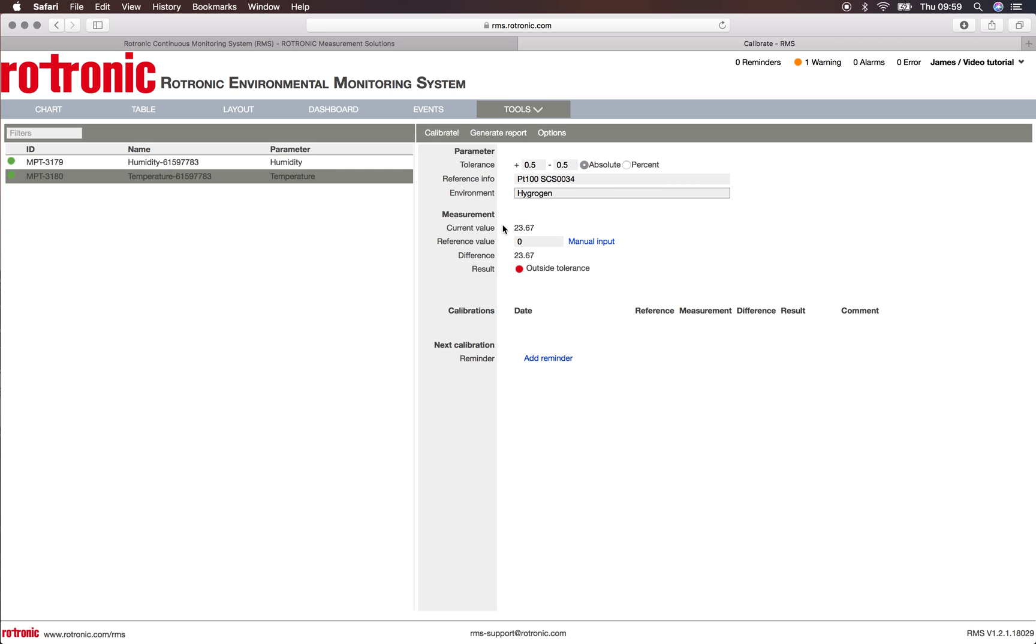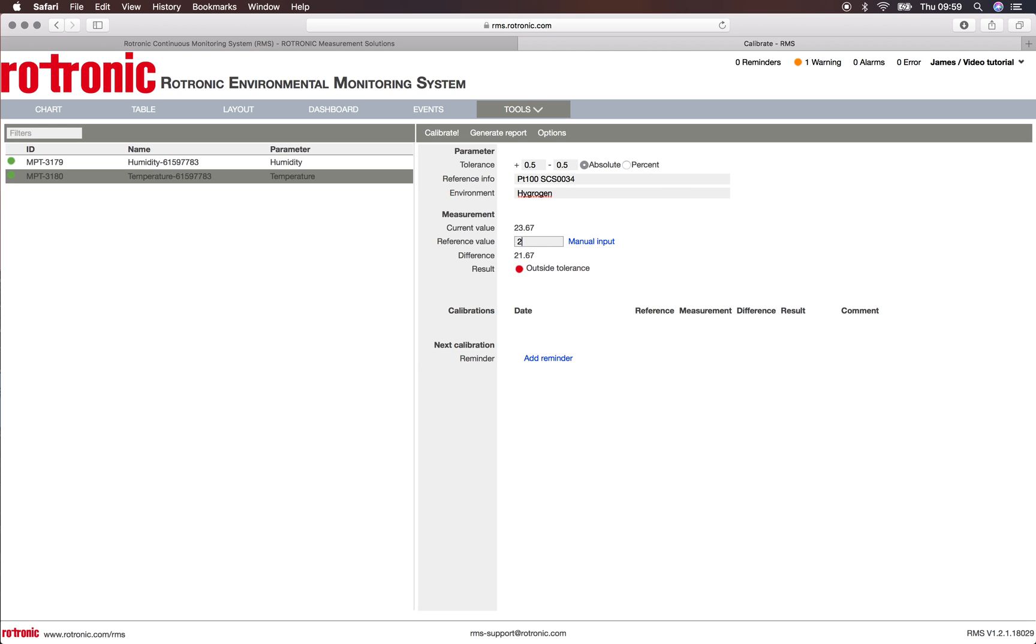We have the current value that is measured by that measurement point, 23.67 degrees. I can put in here my reference value. If I was to put the probe into a Hygrogen, the reference value of the Hygrogen could indicate, for example, 25 degrees.